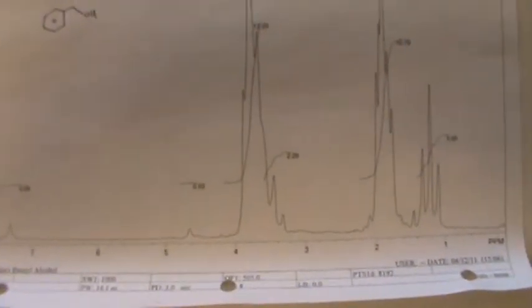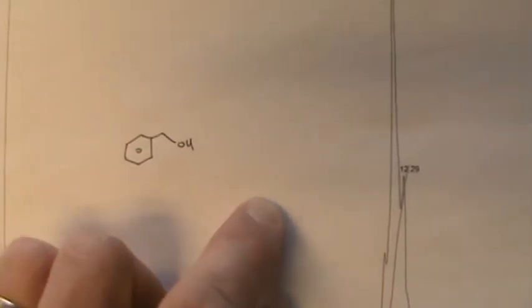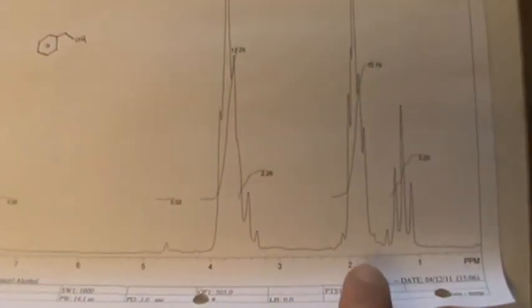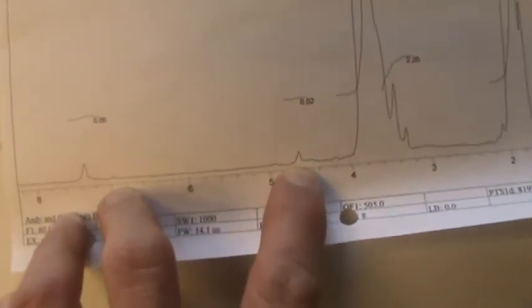Andy and Christina. I guess they probably should have labeled it as primarily THF, because that's what these two enormous peaks are. And hence the triplet and the buried quartet of diethyl ether as well. So basically their sample was almost predominantly THF and diethyl ether. And as far as the product, they get a tiny peak at 7.3 and the corresponding 4.6 peak. So they did not have much product whatsoever.